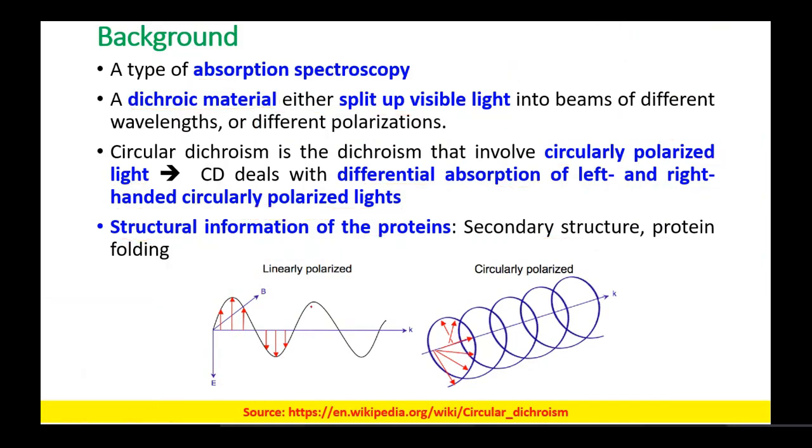Now, before moving forward to the linearly polarized light, we need to understand that visible lights are transverse waves.